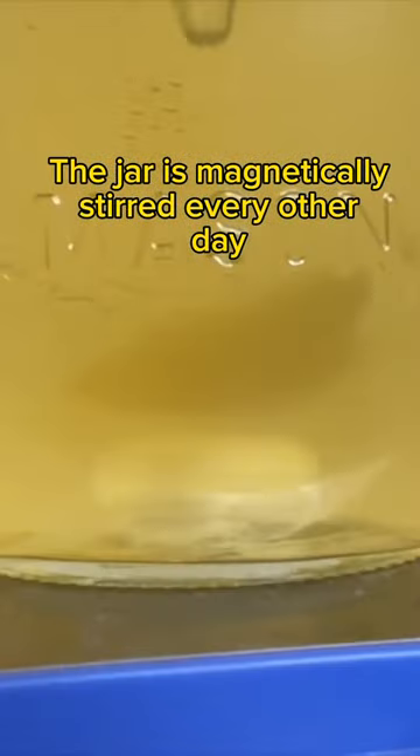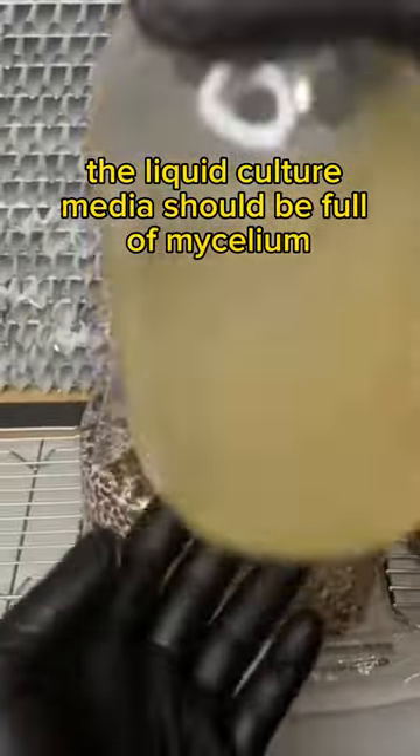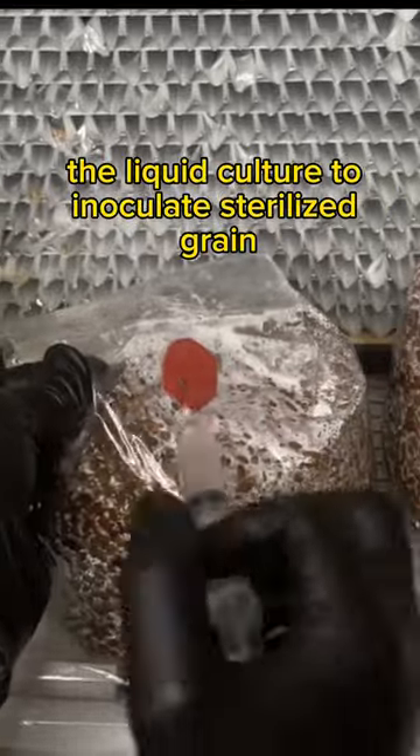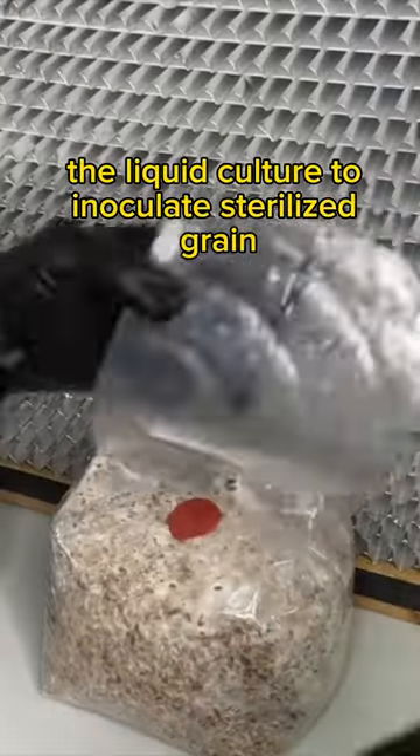The jar is magnetically stirred every other day for a few minutes at a time. After about two weeks, the liquid culture media should be full of mycelium. You can now use two to four milliliters of the liquid culture to inoculate sterilized grain.